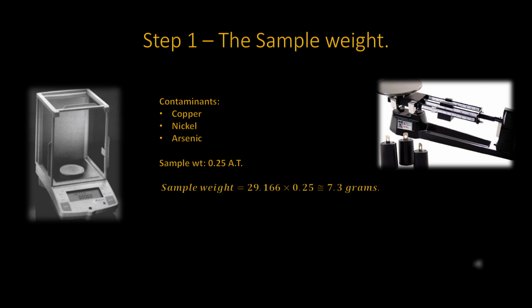The ore consists of a lot of contaminants. Therefore, the required amount of 0.5 of an assay ton is not used. If you are not familiar with the charge table, I recommend reviewing the previous presentation, which is part 12, The Fine Art of Fire. The constituent material in this ore sample contains sulfur, and therefore will be treated as a class 2 ore.